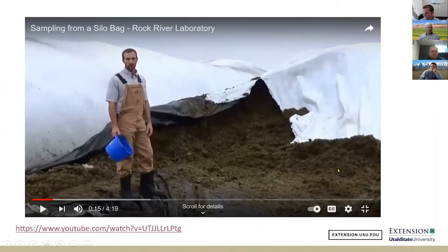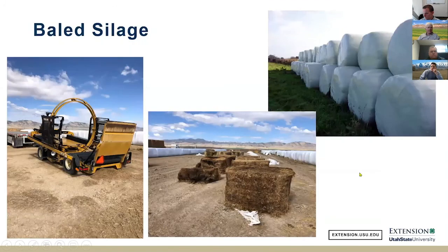Other interesting challenges are sampling baled silage, which is bales that are baled wet and stuffed in various tubes or wrapped. Usually a silage or some type of hay sampler will not work well because the sample is wet.